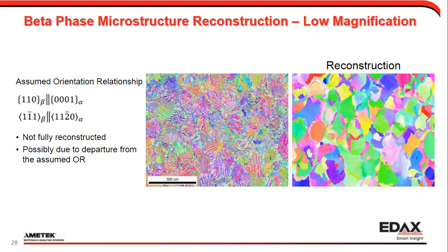And there are some very interesting things there in that you see some color gradients within some of the grains, and that's an indication of orientation gradients. And if you've looked at some of the AM, the additive manufactured microstructures, you get these kind of unusual microstructures, at least compared to the kind of stuff we're used to seeing. But this is what they tend to look like.